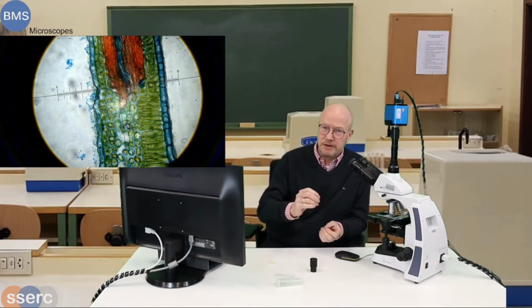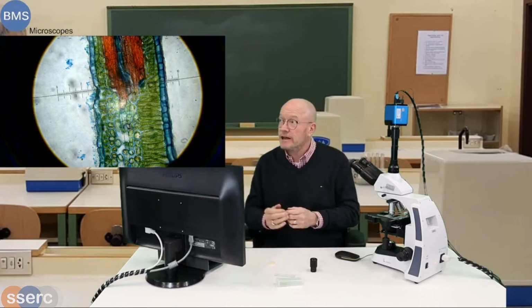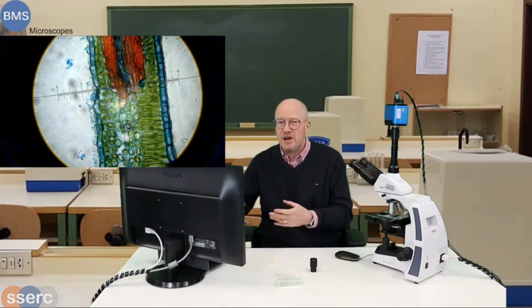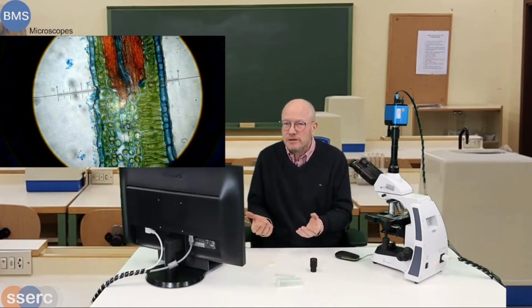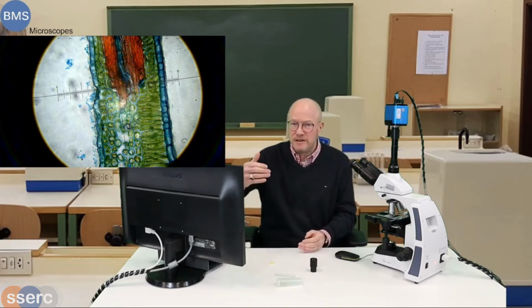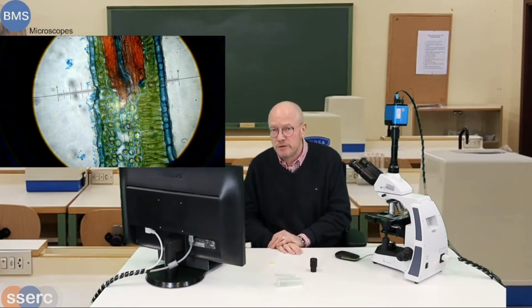I must be honest though, that what I've just seen is spot on. Normally you can have some difference. You can see as well, if I find 150 microns or 140 or 160 microns, what is 10 microns on magnification from 4 to 10 to 40? You have to be reasonable there.